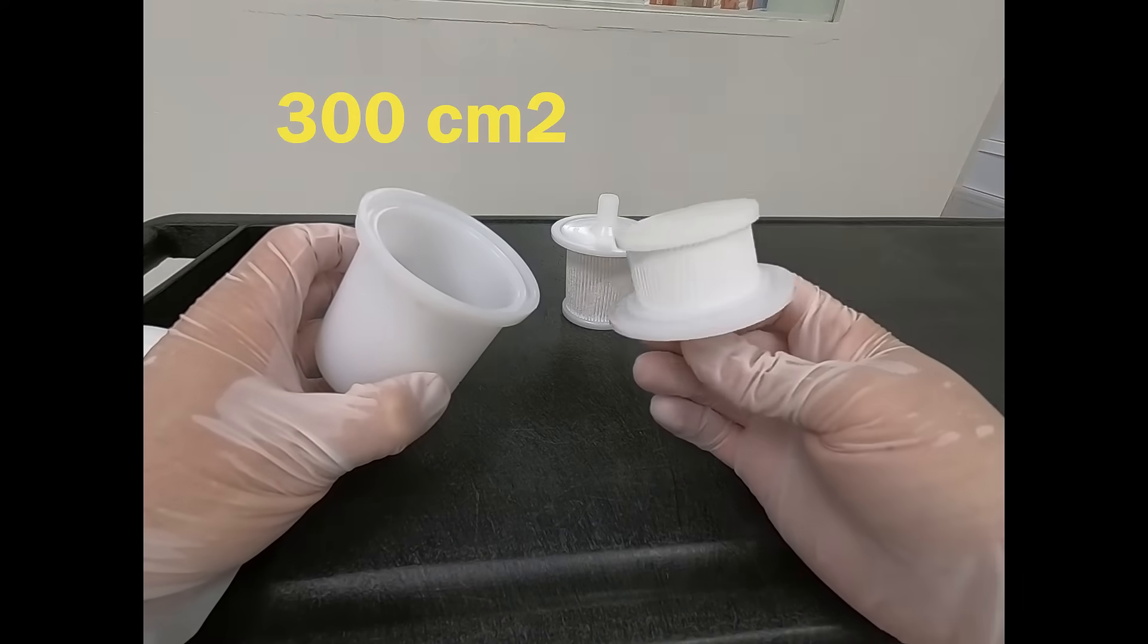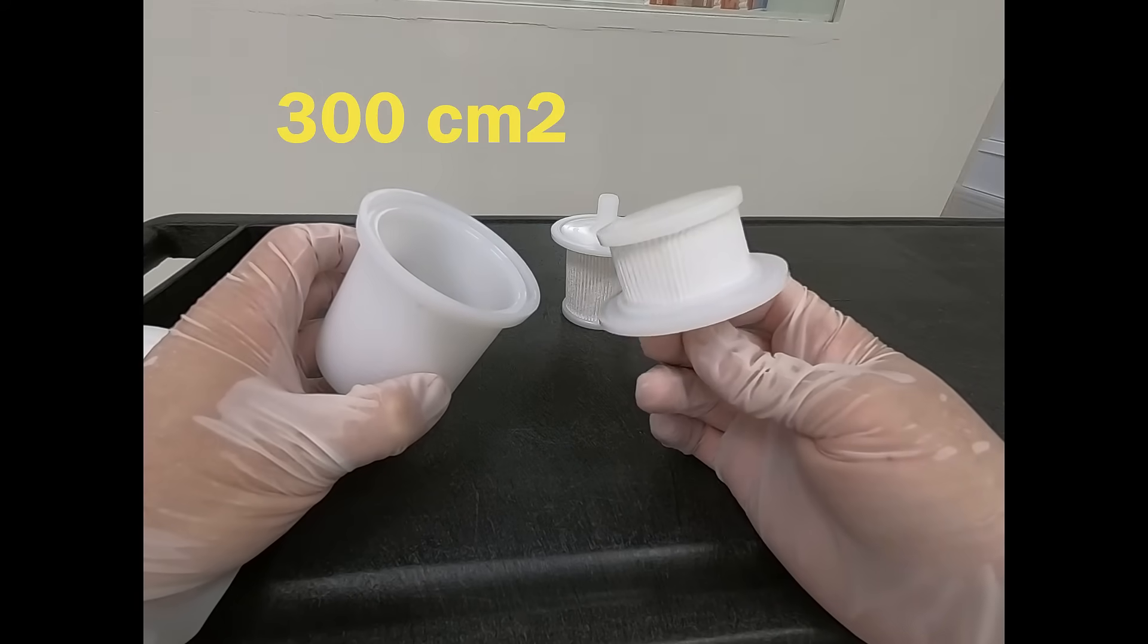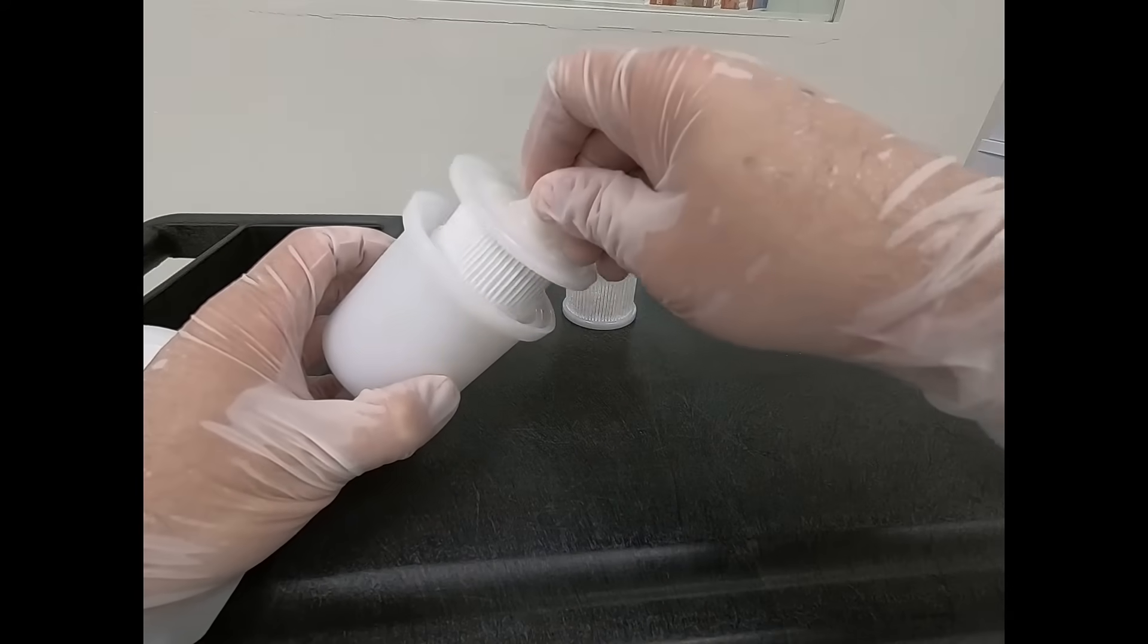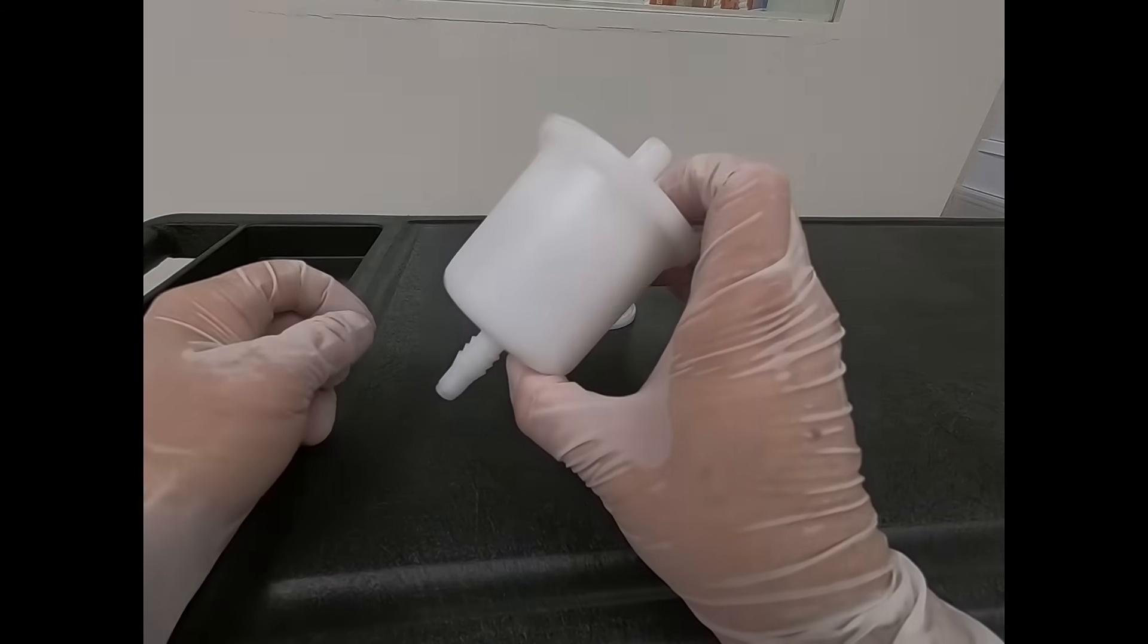The smaller 300 square centimeter filters provide our customers with a more economic option for field filtering when low turbidity is encountered or expected.